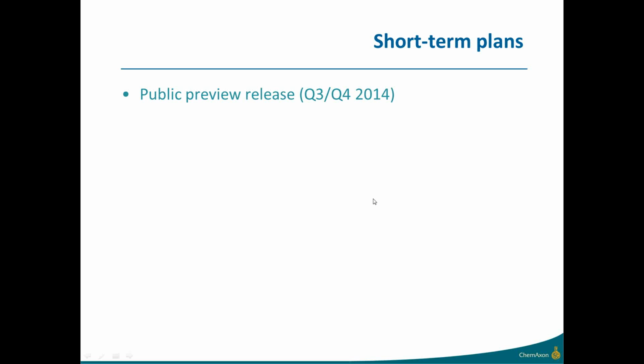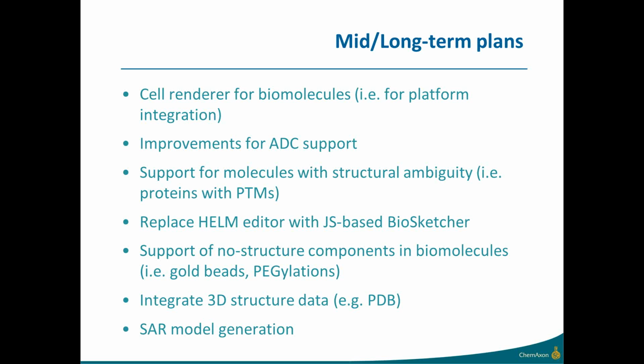Imagine in the case of ADCs that you do have a conjugate and you do know it's probably bound to a certain amino acid residue, but you don't know its exact location, or you have some mass spec result indicating that on a given fragment you have a modification which sits on one or the other amino acid, but you can't really tell which one it is, then it's something which still needs to be found in the representation, and we have to support additional data for this.